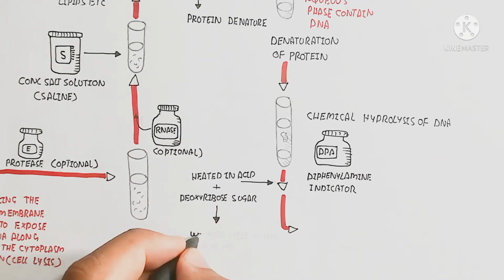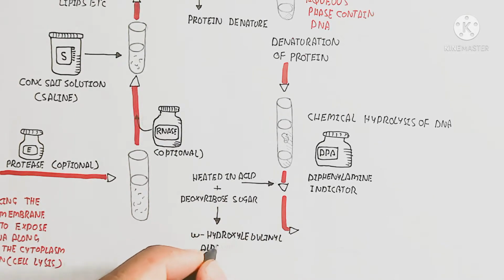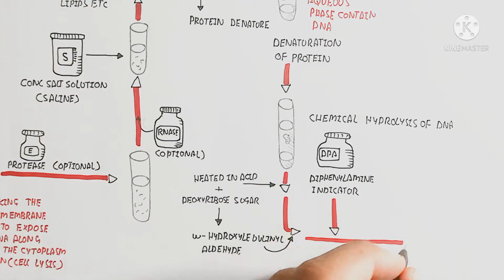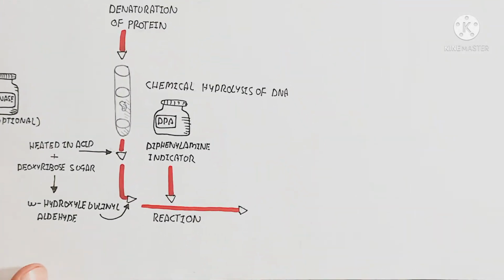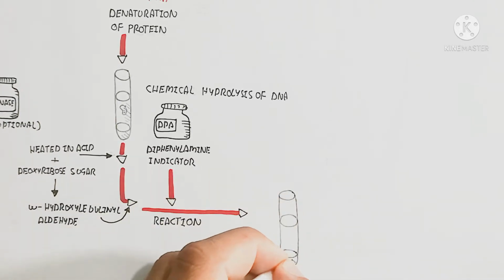The addition of the acid shows a blue color through the reaction of hydroxylevulinyl aldehyde in the presence of the diphenylamine indicator. That reaction produces a blue color that a spectrophotometer can detect.